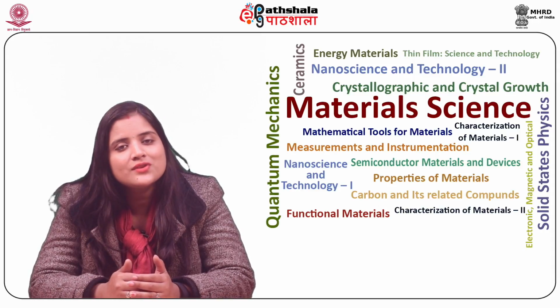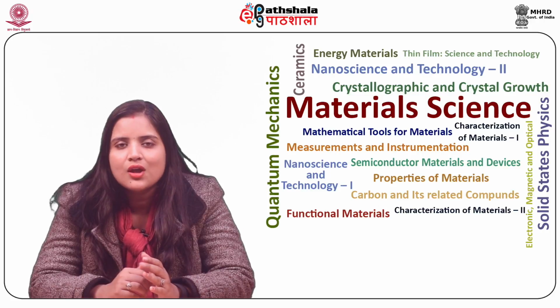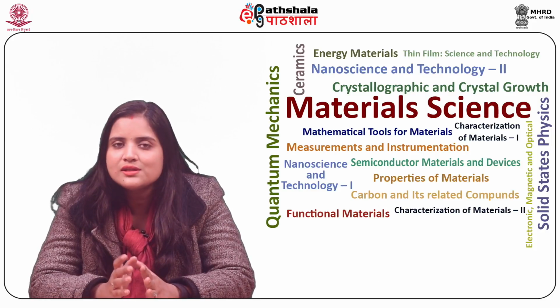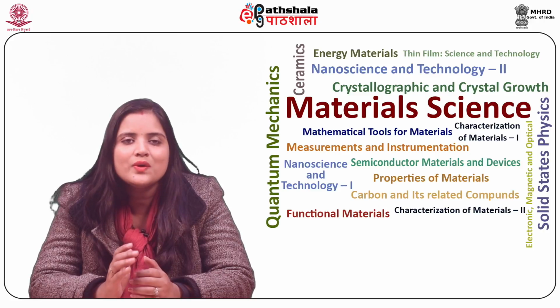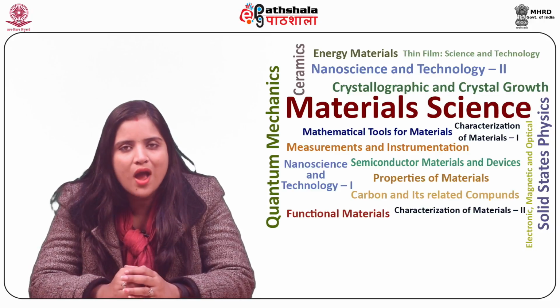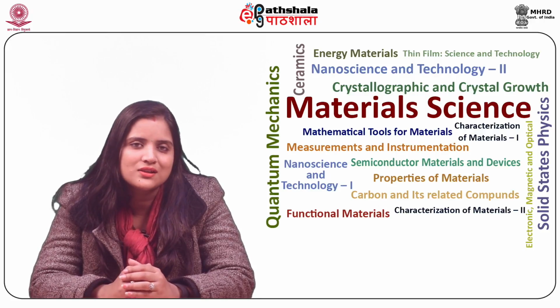This is achieved by performing instrument calibration using samples of known composition, subsequently evaluating the results quantitatively in addition to evaluation of miscalculations. In a case where 4 to 5 spectrometers exist, 10 to 12 elements can be acquired.